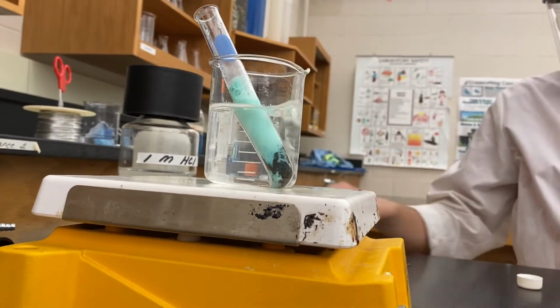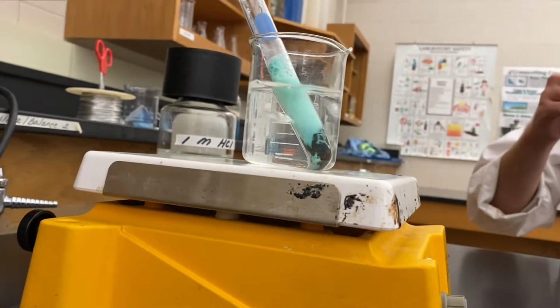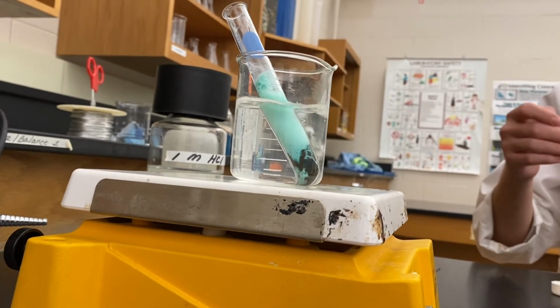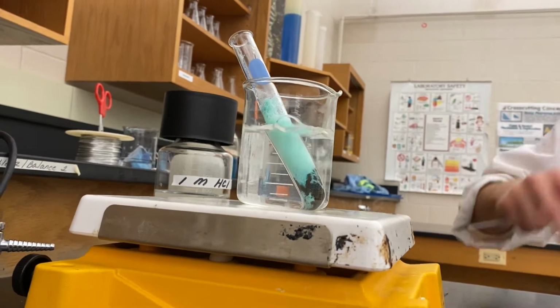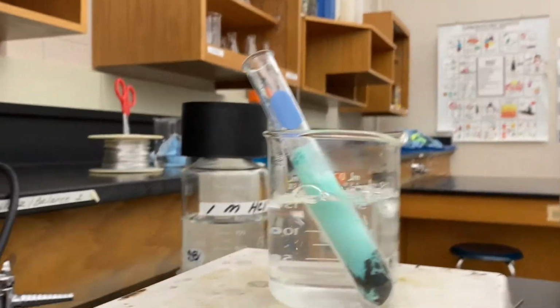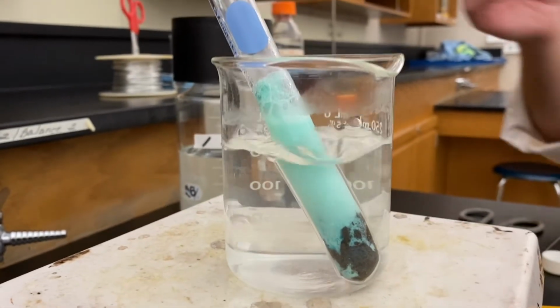I'm going to add a little bit more. Add a little more sodium hydroxide to make sure we get a complete reaction.